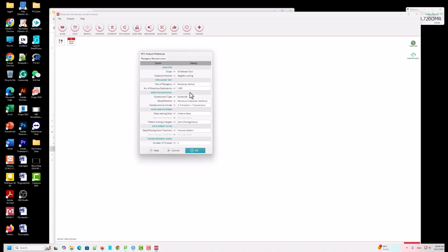So here you will use 1000 replicates, but remember it will depend on your PC, on which type of machine you are using. If it is a high computing facility, it will take less time, but if you have a simple small laptop with minimum RAM and processor, then maybe it will take some time.